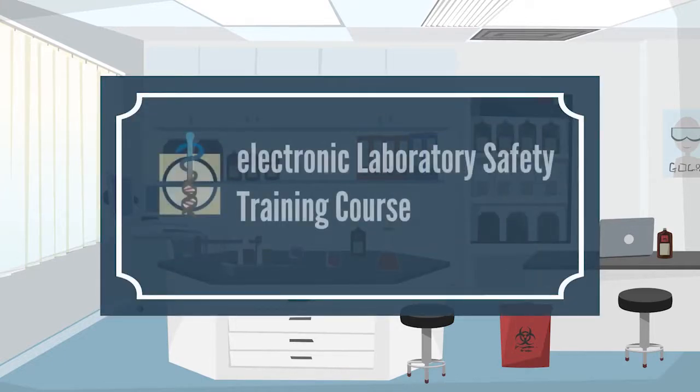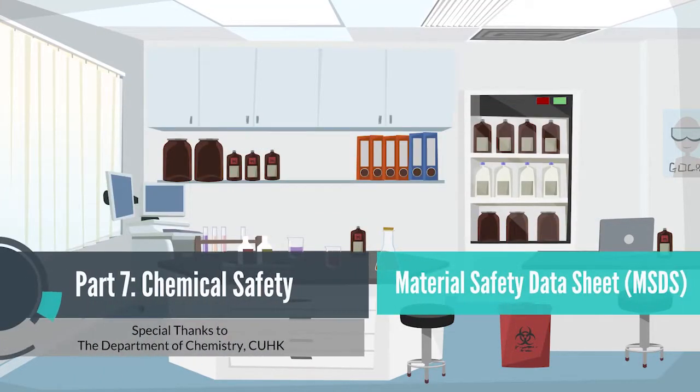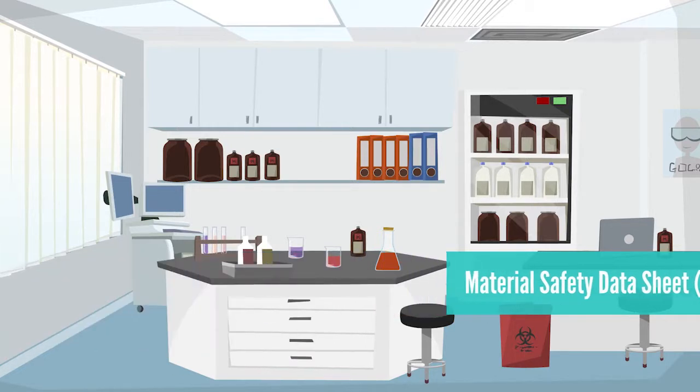Electronic Laboratory Safety Training Course. Part 7, Chemical Safety. Material Safety Data Sheet, MSDS.